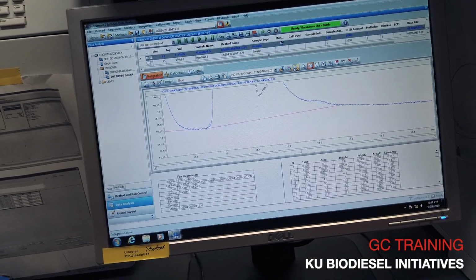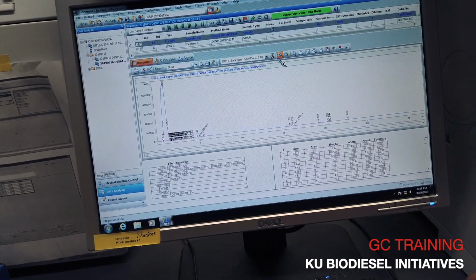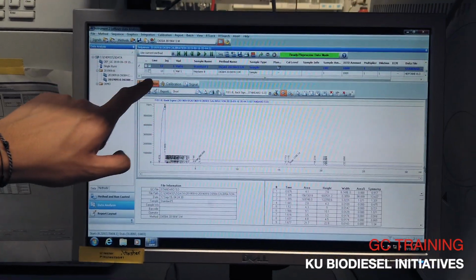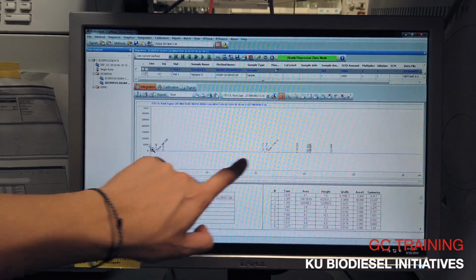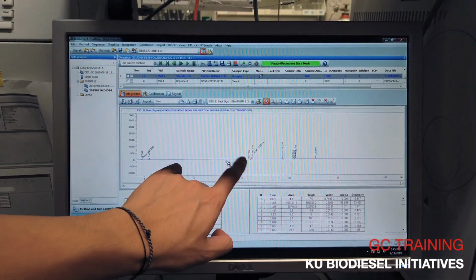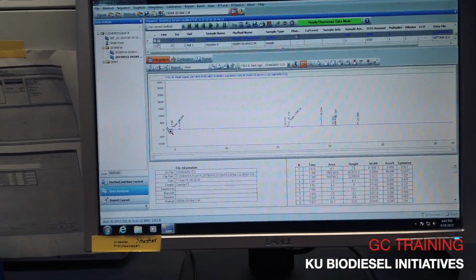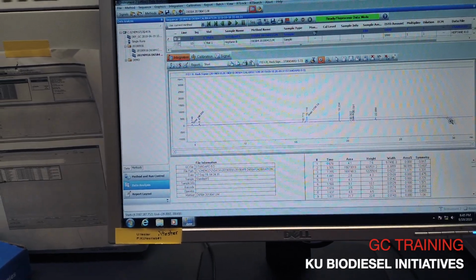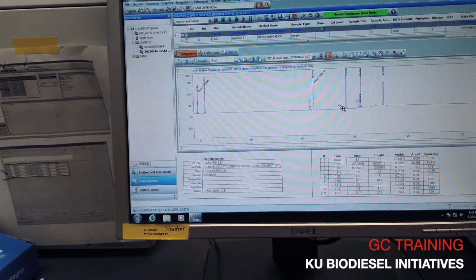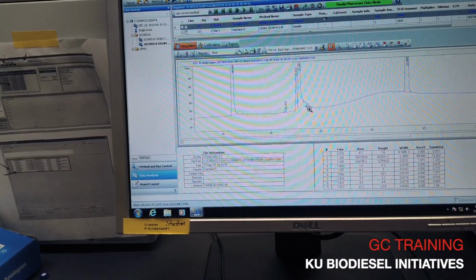And then I got a bunch of really confused questions from the engineers at PerkinElmer, because they were like, why are you asking this? When you hit integration, it will automatically integrate all the baselines for you. So you are just using this to calibrate the baseline? Basically it'll already have it integrated based off of its standard settings. Okay. And so now you're just modifying it? Yes, I'm modifying it based off of what I see.